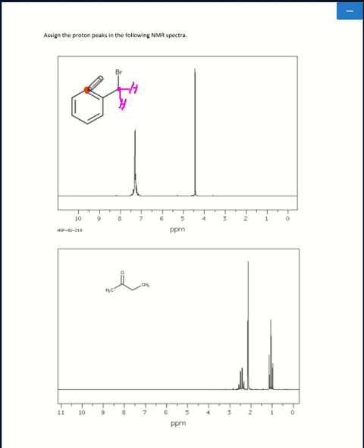Well, a double bond and a single bond adds up to 3. Therefore, there's one bond not being shown, and that is going off to a hydrogen. And that'll be similar for most of the other carbons as well, where these other carbons are single bonded to just one hydrogen atom.